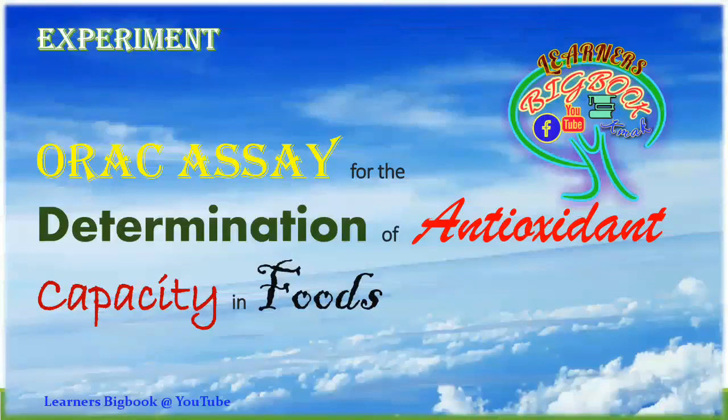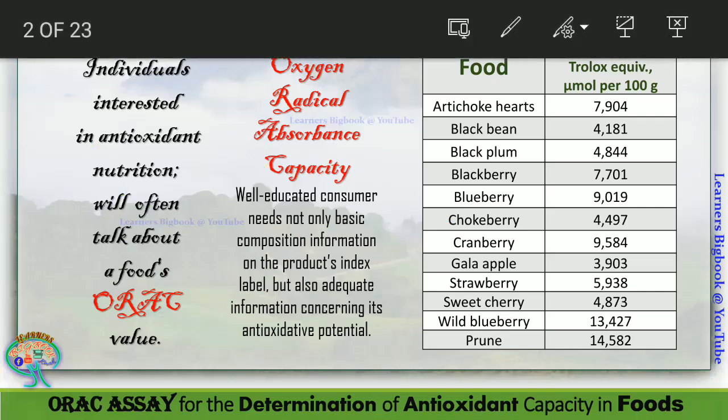Hello guys, today we are going to discuss the new experiment. So Learner's Big Book has come up with an experiment of ORAC assay, where the determination of antioxidant capacity will be done in foods. So, further, the next slide.